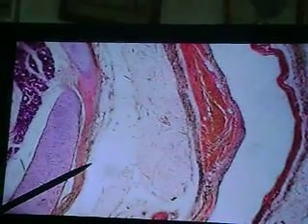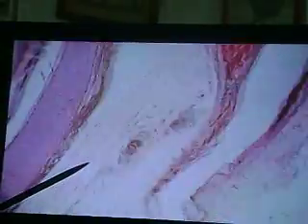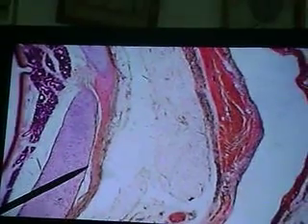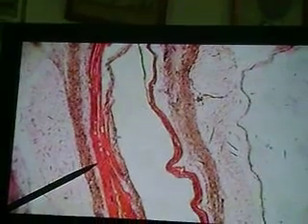Now the smooth muscle. That's the trachealis muscle, where the little ends are, just posteriorly. That's a little nerve, a little bit there. Let's trace it back around here. So all of this here should be some smooth muscle in this region right here. You can see, all of this is smooth muscle.